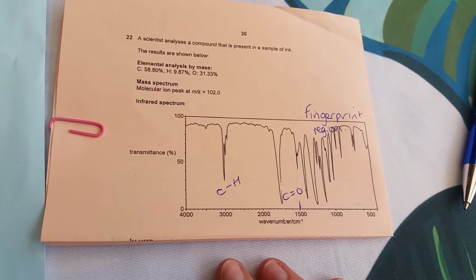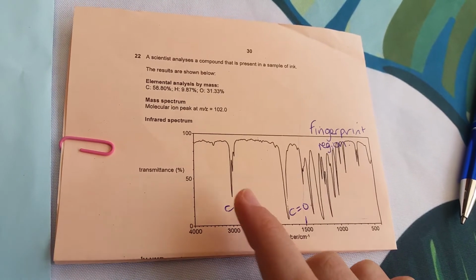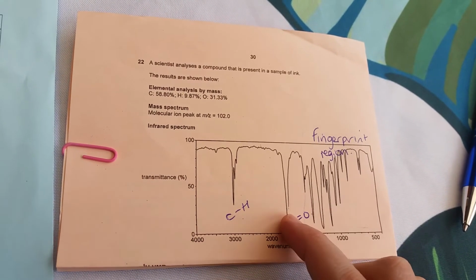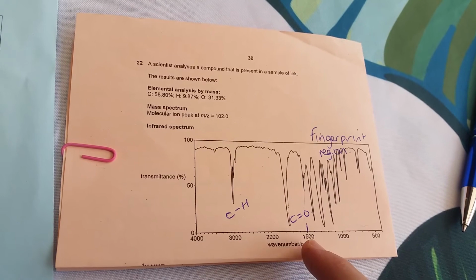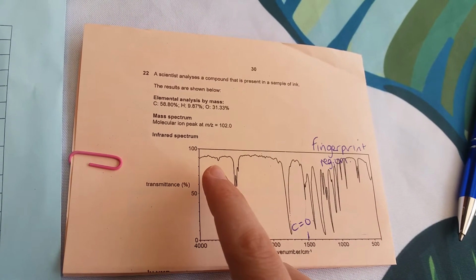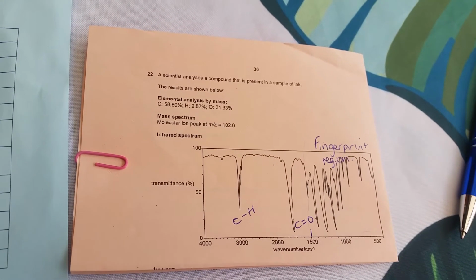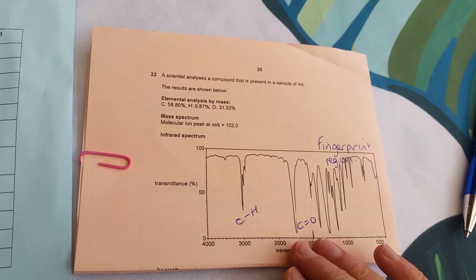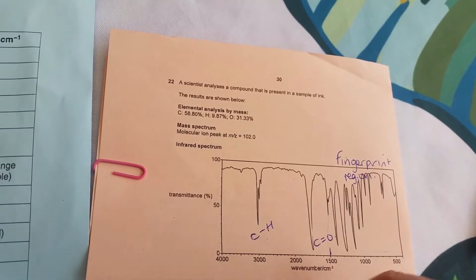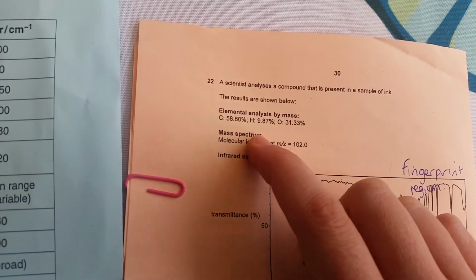So that's the first example. That's how an IR spectrum looks. That's what we do. We label the peaks on the left hand side of the spectrum that are above 1500 in wave number. Only the major peaks. We ignore that little piffly thing up there. Not interested in that. And it tells us what groups are in the molecule. We've got other information which we're not going to do much with today. Well, we're not going to do anything with it.